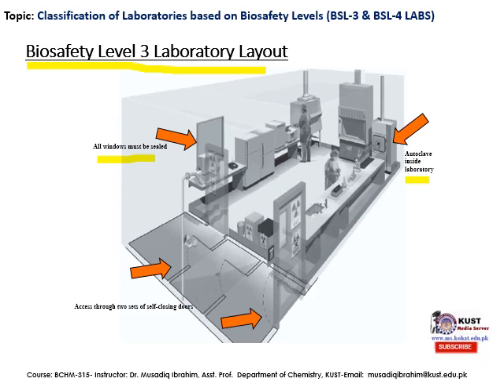Now access to the main area of the lab is through two sets of self-closing doors. Here you can see that this is the first door, and then this is the entry, and then this is the second door, and then you can enter into the lab. And these doors are self-closing, as well as they have the biohazard sign posted onto them.